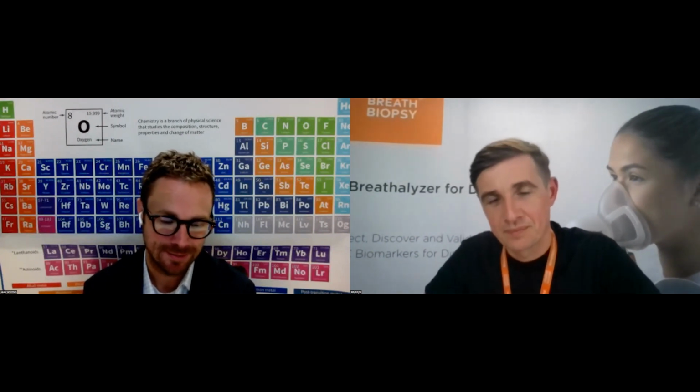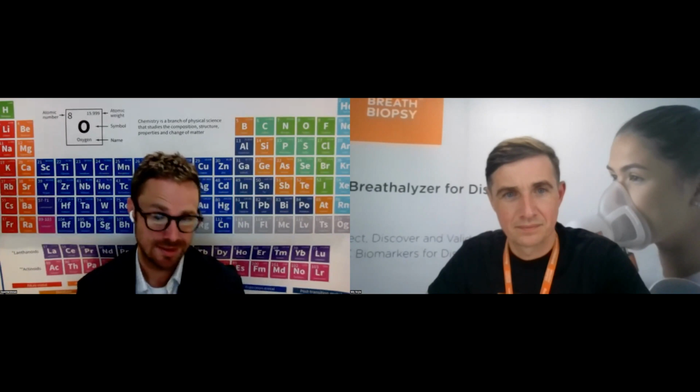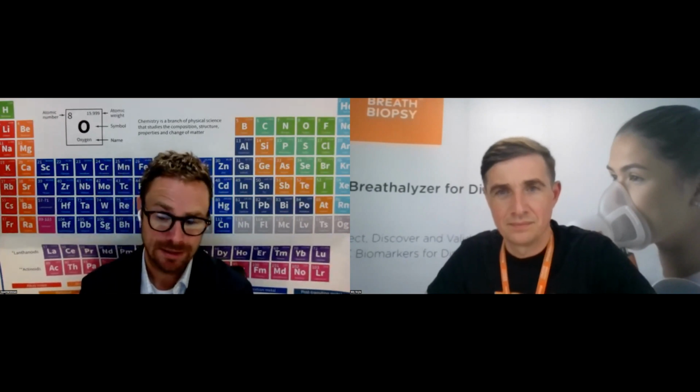All right, so there's a number of questions there. So the first, on breath, I feel that a lot could be done with isotopically labeled glucose, where you could then look in your spectra to see where there are multiple peaks that correspond to shifts in mass. It is a potential option to really get at endogenous versus exogenous, right? Your exogenous compounds would not be labeled. Now there are IRB and ethical issues that go into that, so we have not pursued that for those reasons at the moment, but that doesn't mean that it's not a viable option.